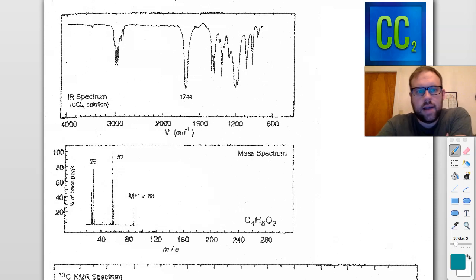All right guys, we are back with another ChemComplete lesson, and this time we are doing yet another unknown structure with spectroscopy.